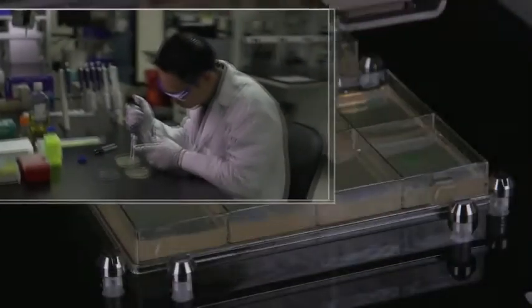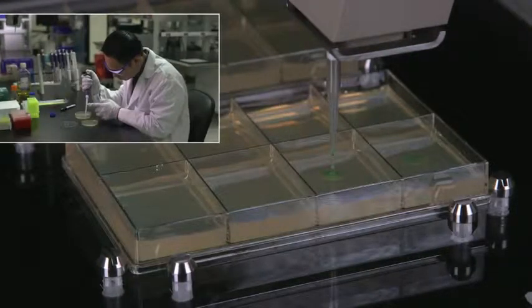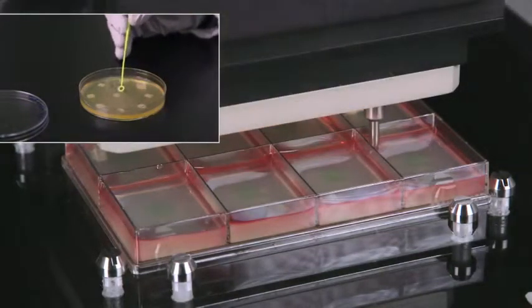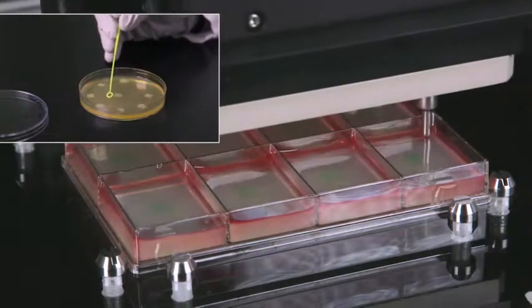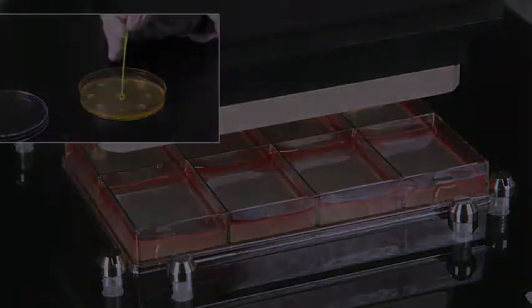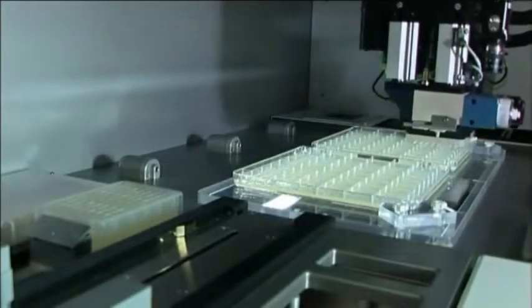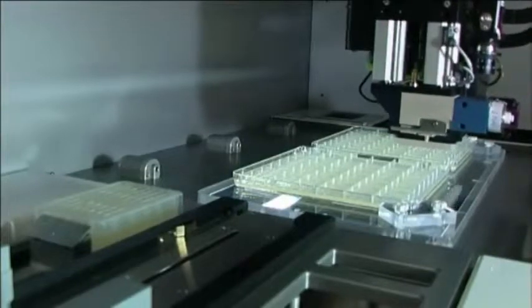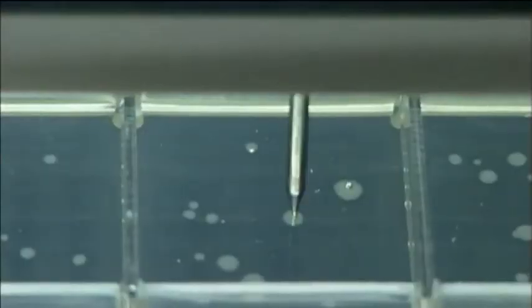The QPIX takes a laborious manual process and automates it. For example, a scientist can pick 300 microbial colonies per hour, whereas the QPIX automation can pick 3,000 colonies in that same period—that's the equivalent of 10 FTEs. As well as picking this quickly, we pick accurately to within a few microns. This means there are virtually no misses or double picks, a common error in the manual process.